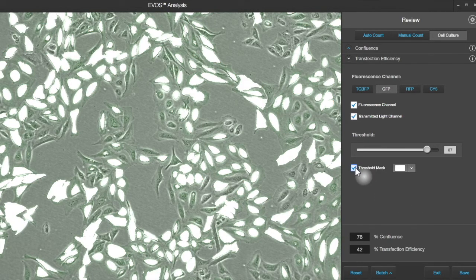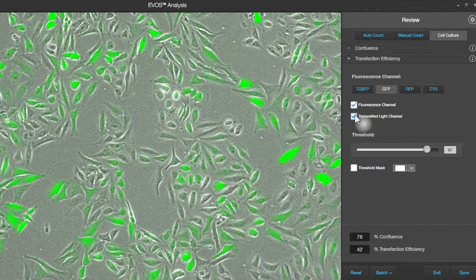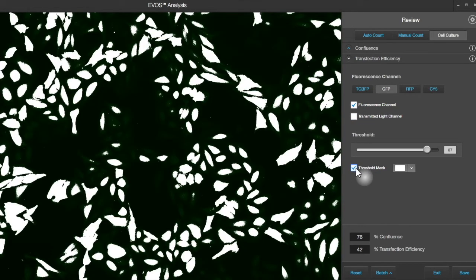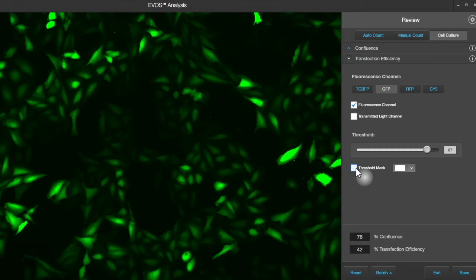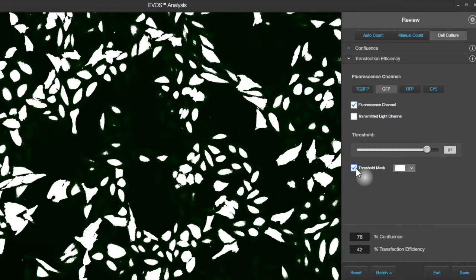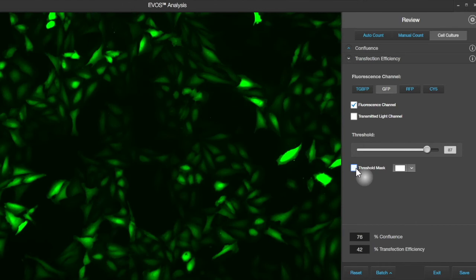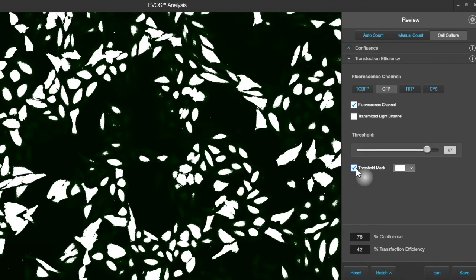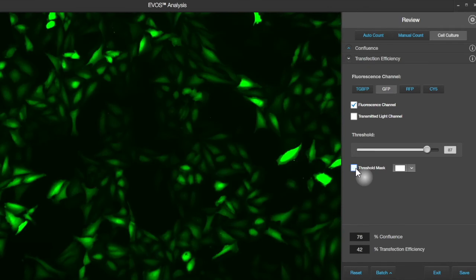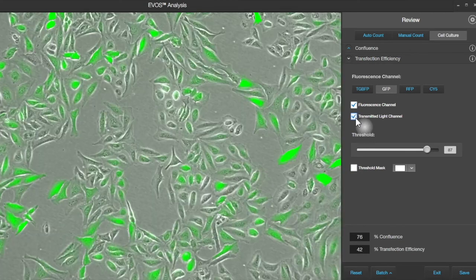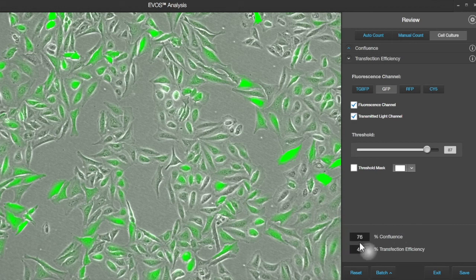We can toggle the mask on and off and see what has been selected. It's also helpful to turn off the transmitted light channel and check — you can see that pretty much most of the bright signal has been picked up by that selection, and the dimmer signal has been left behind. So we'll go ahead and select this and go with these measurements. Right now we've got 76% confluence for this field of view and 42% transfection efficiency.